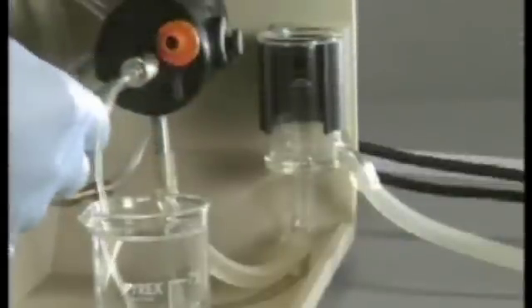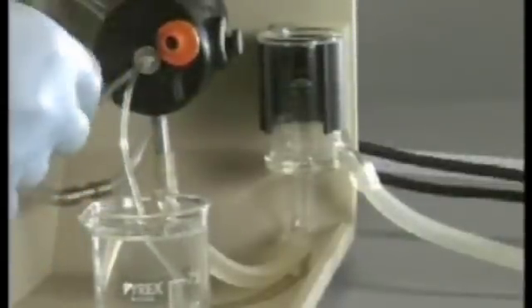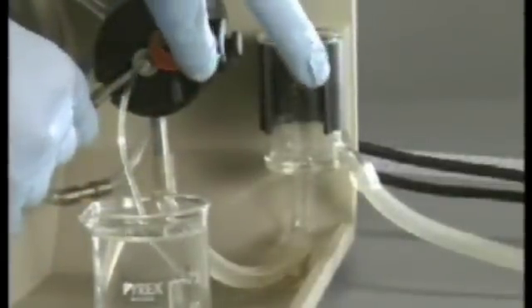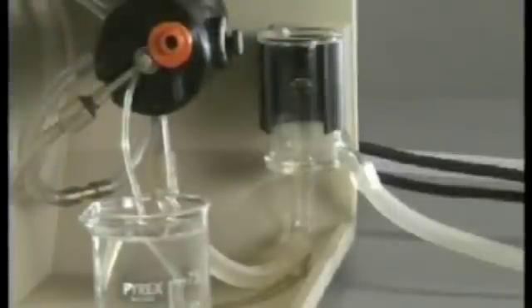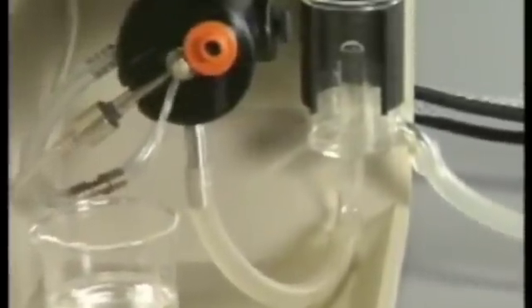This then enters the nebulizer where it mixes with the gas. The nebulized mixture of gas, air, and solution is fed to the burner. Excess liquid from the nebulizer passes into a standpipe which stops air and fuel escaping, but allows excess liquid to run to waste.